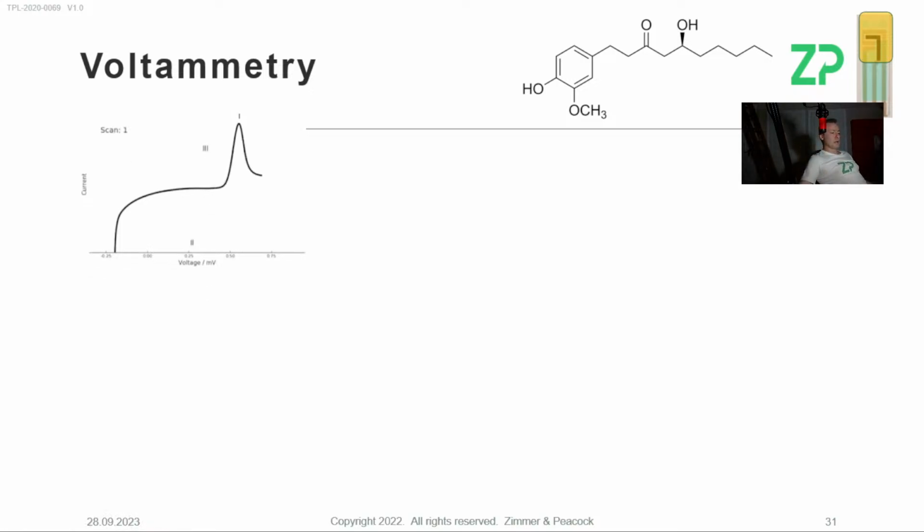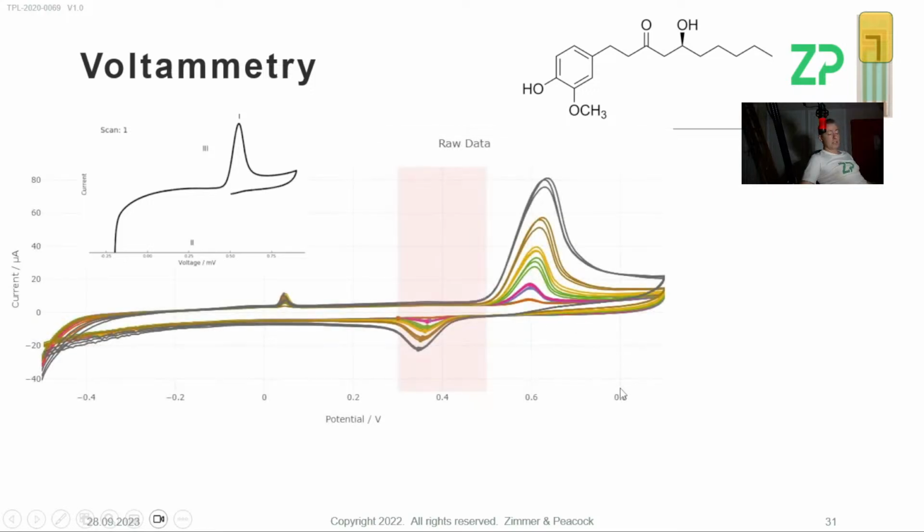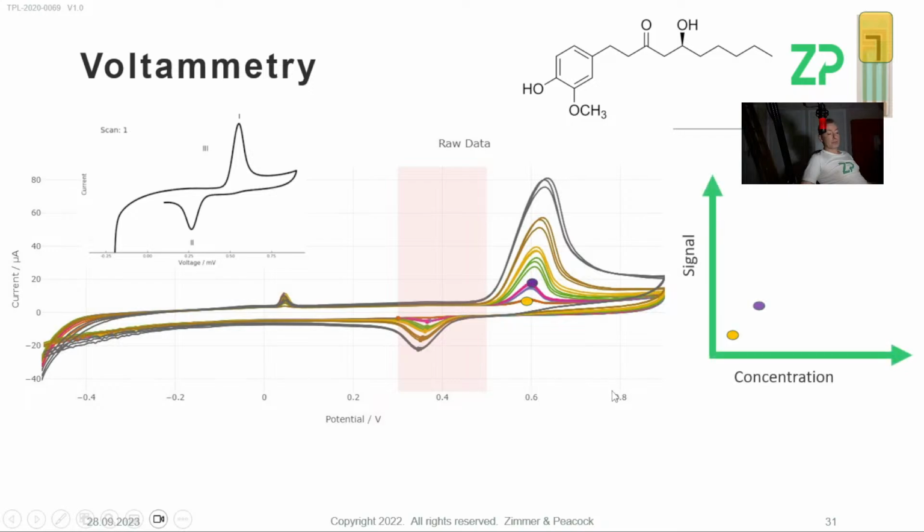I could also be talking about non-steroidal anti-inflammatory drugs and stuff like that. This is the kind of data we would be expecting. These are different concentrations. You can see, it's not like our voltammograms here are absolutely perfect, but you do get a sense that our repeatability is not terrible. It's certainly, when I sort of say that the underlying electrodes are kind of 5 or 6%, you need that in order to get this kind of reproducibility.